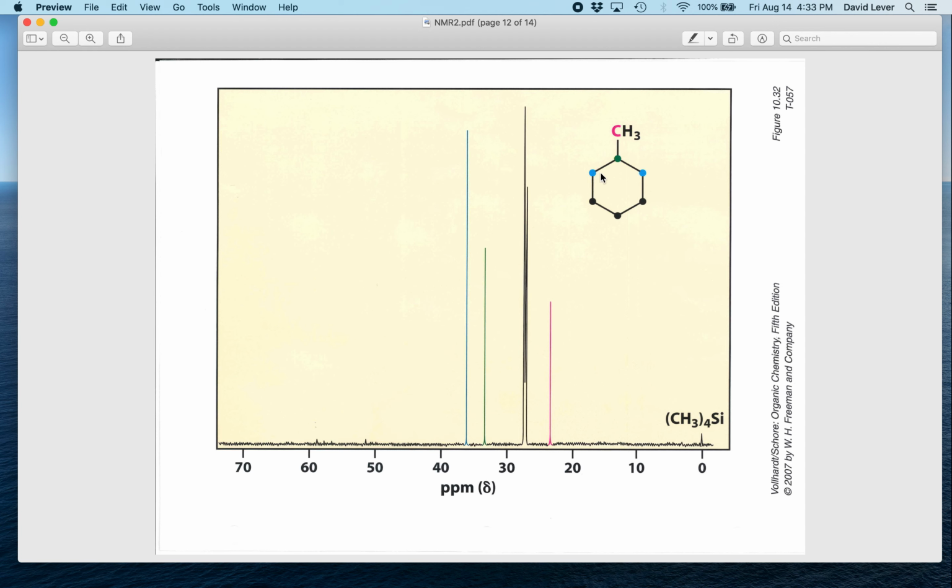The CH2 groups adjacent here are showing up as one singlet because of their magnetic equivalence, and then these two black hydrogens show up as a slightly larger peak than this one because there's only one CH2 at the 4 position versus these two, right? You can't use the integration here very well because in general methyl groups are bigger than methylene groups, and methylene groups are bigger than methine groups. So we have both the nuclear Overhauser enhancement because of the adjacent hydrogens and the fact that there are 2 of these and only 1 of these, and we can't decouple those.